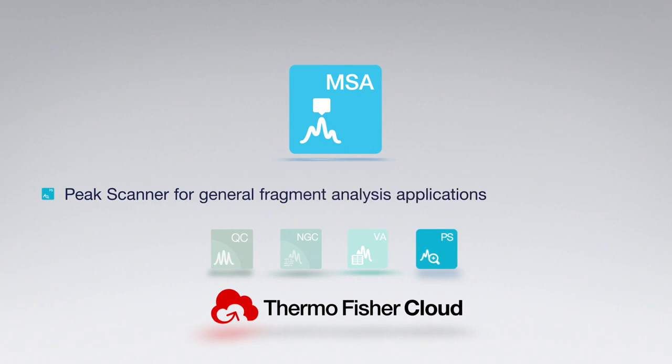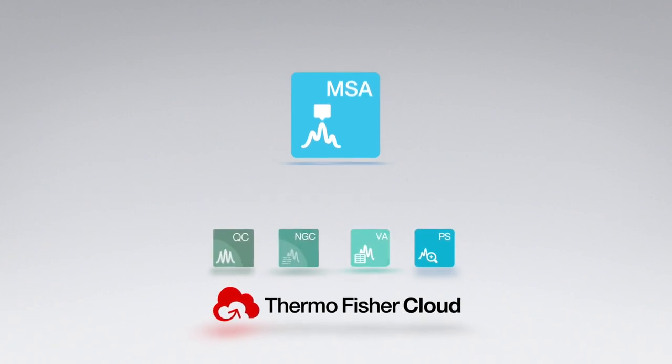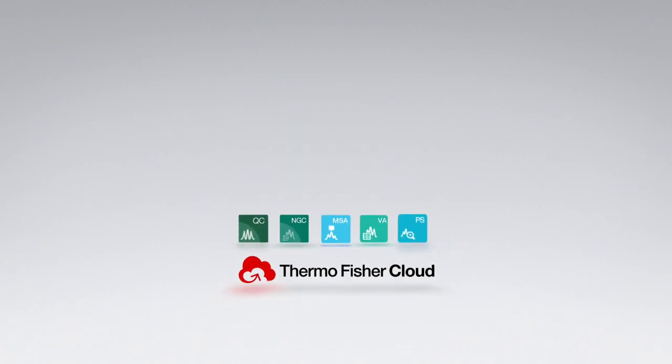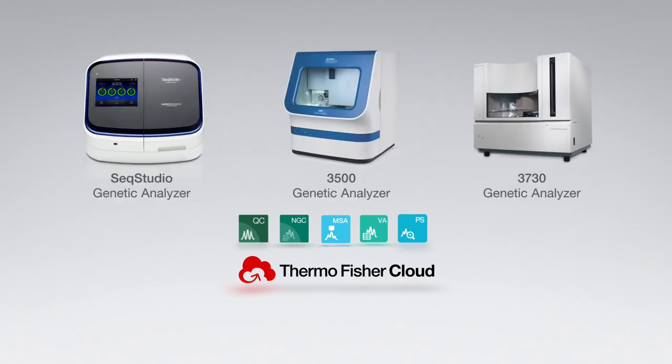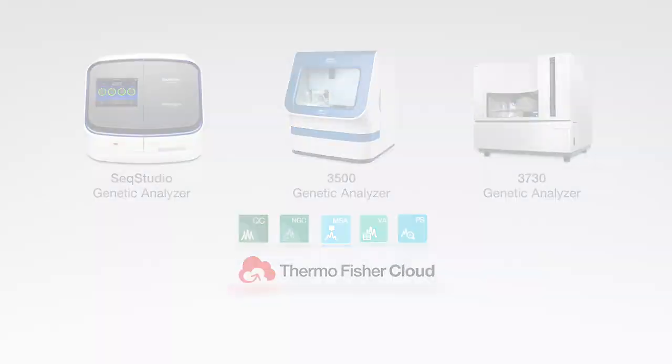Peak Scanner for general fragment analysis applications is also included. These applications have been designed to work seamlessly with our capillary electrophoresis instruments, including Applied Biosystems SeqStudio, 3500, and 3730 genetic analyzers.